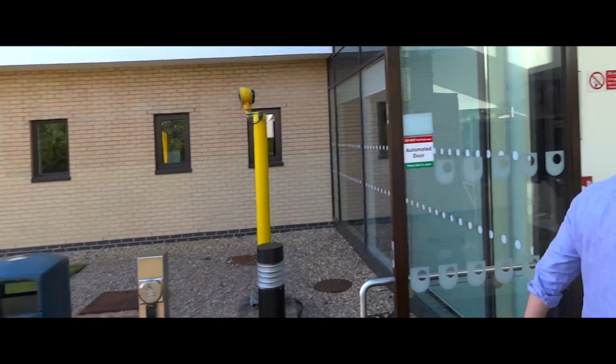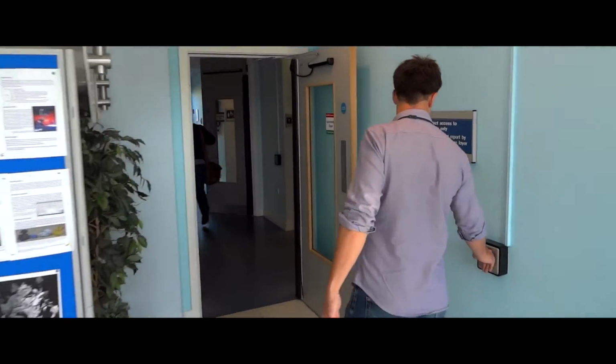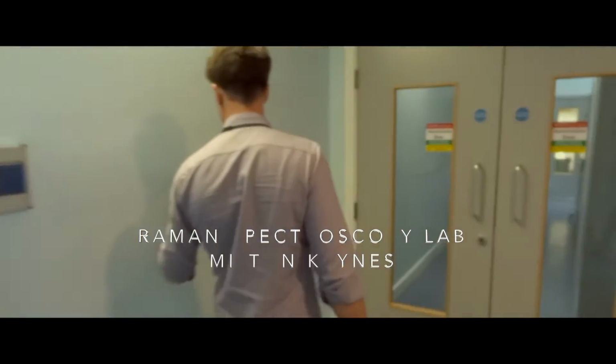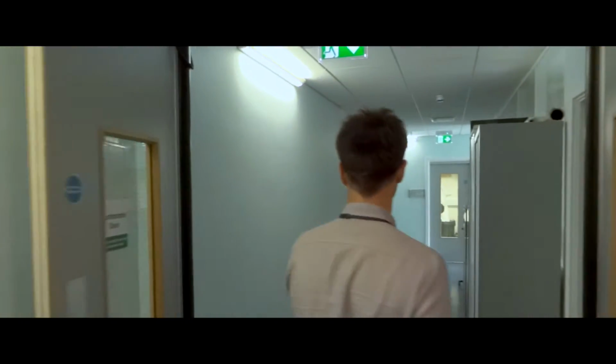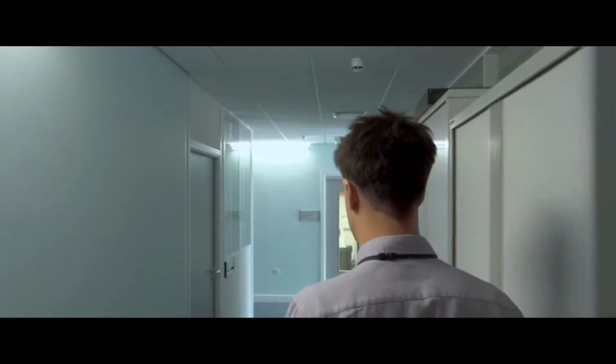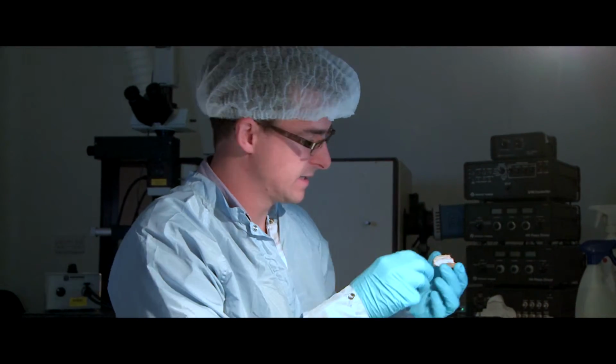I'm back from Atacama now. I had a suitcase full of rocks to bring back through customs of geological samples. And I brought them here to the Open University, where I'm doing a lot of the analysis on the microscopic Raman spectrometer they've got here. I've got one of the samples here that I brought back from the Atacama.